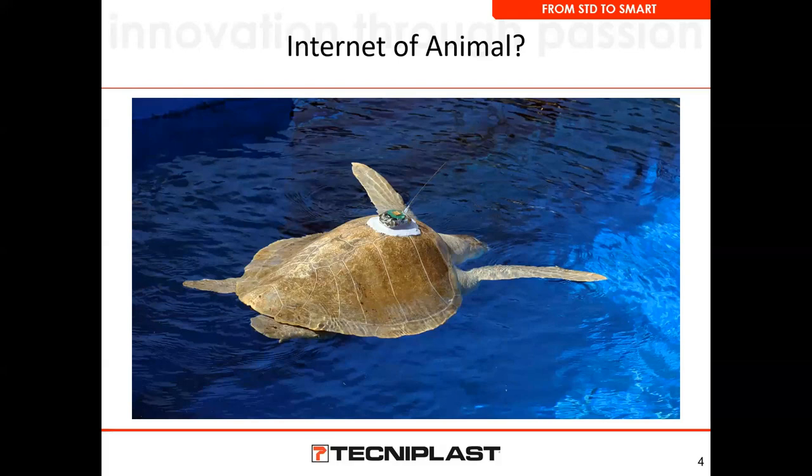But in reality, we do a lot of our testing, open field tests, maze tests, outside of the home cage. So really this is trying to take a look at what data we can gain from the animal in our behavior and research that will help us without having to take that animal out of the home cage into a different environment, potentially causing stressors, and how we can move forward. So the question now is, if this technology was available, how would you use it and would you use it?